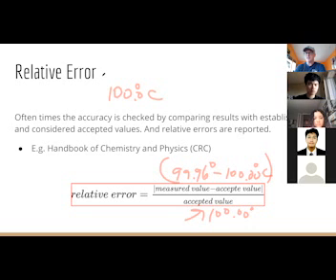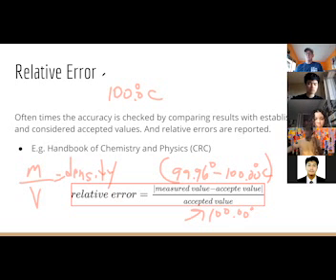How do you measure the mass of something and then calculate the volume of it? Is it because we know the density of water? Precisely. Exactly right. Excellent. Yeah, because the ratio of mass to volume is equal to the density. And we know what the density of water is because scientists have been measuring that very accurately for hundreds and hundreds of years. So there's a table in the lab manual that gives you the whole list of densities. You can also just look it up if you wanted to.